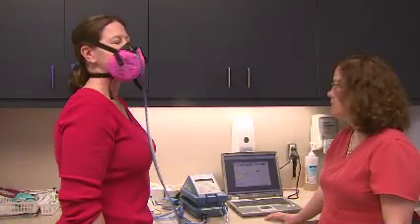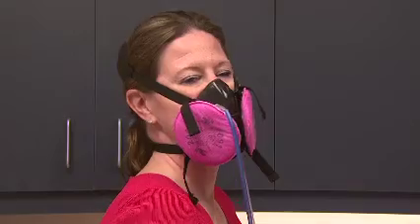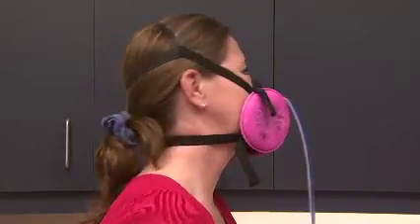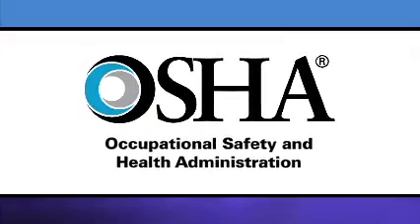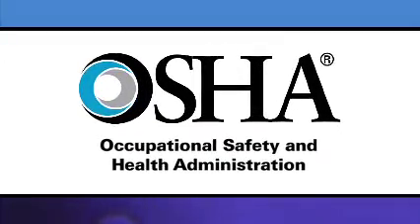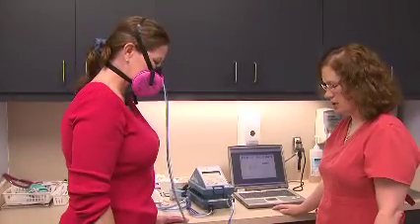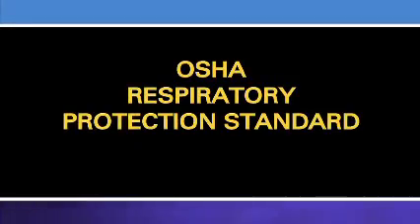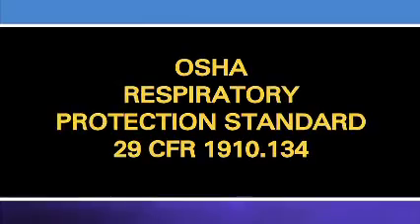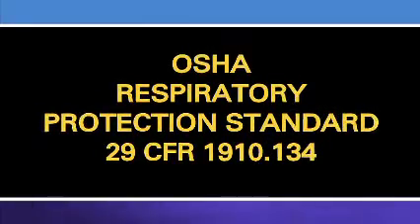This video is about the respirator fit testing requirements for any worker who is required to use a tight-fitting respirator. The Federal Occupational Safety and Health Administration, also called OSHA, and state OSHA agencies require employers to fit test workers who must wear these respirators on the job.